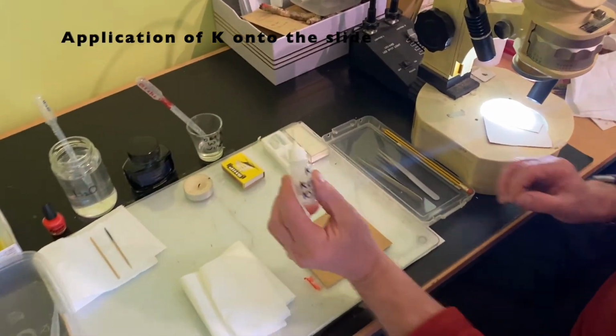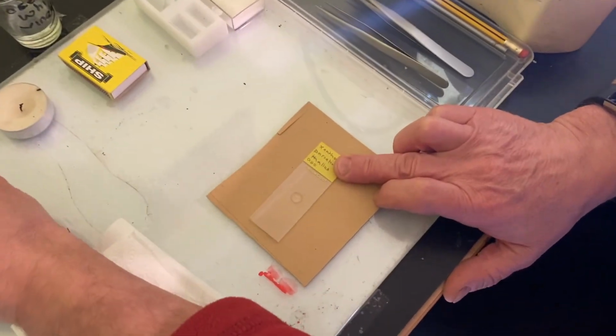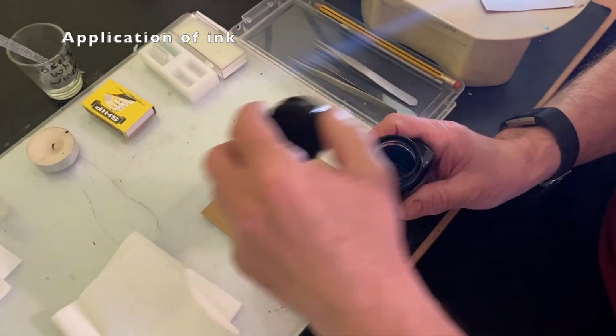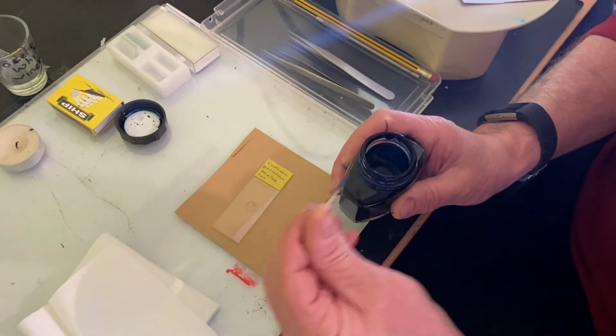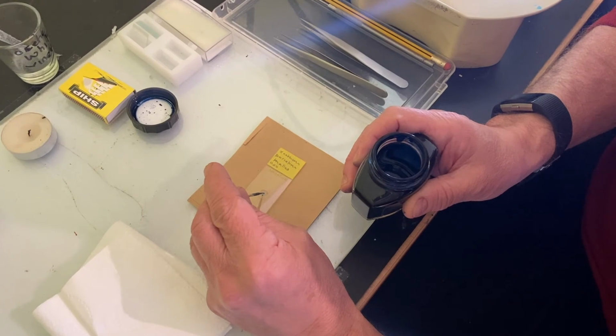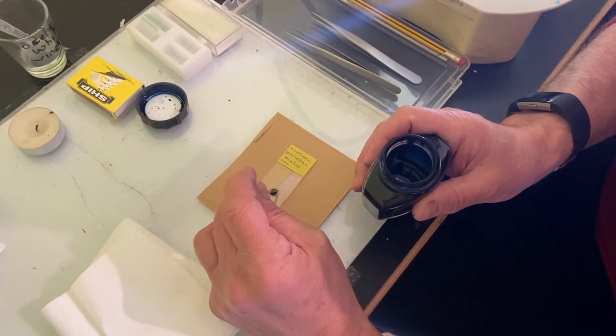Application of K onto the slide. Apply just one drop of K onto the labelled glass slide. Application of ink. The next thing to do is to apply a drop of ink to the K. I use a cocktail stick, and you will see that this may take a couple of goes to obtain a good ink drop.